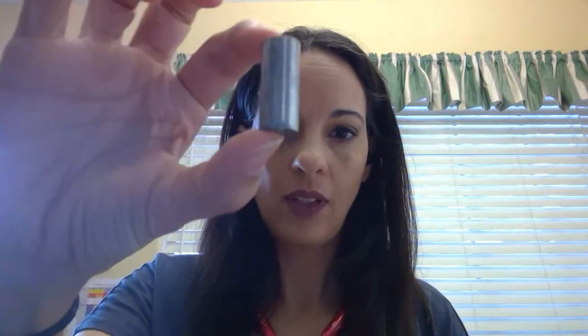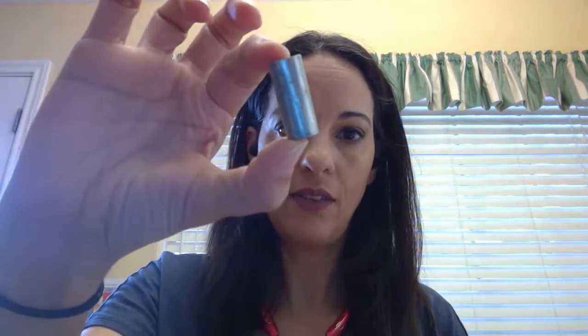All right, and our last one, element number 6. You can see that it is reflective. It's catching the light and reflecting it. I can tell by the way it is shaped that it was able to be shaped into this tube, so that it is malleable, because otherwise they would not be able to make this shape. If I took a hammer to this, a really, really super strong hammer, or if I was Superman, I would be able to bend it without breaking it. And if I use my conductivity tester, then I can see that it lights up. So fill out your chart for element number 6.